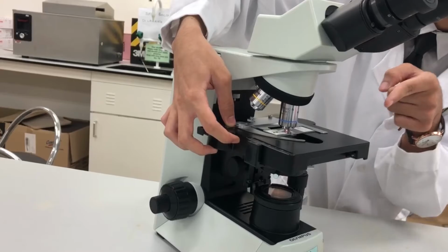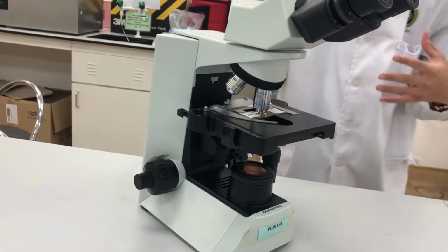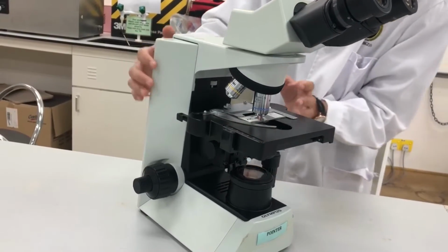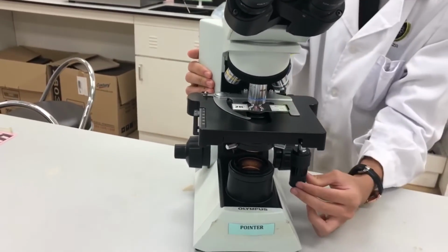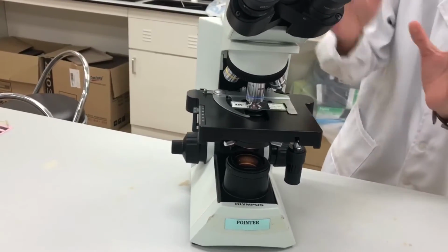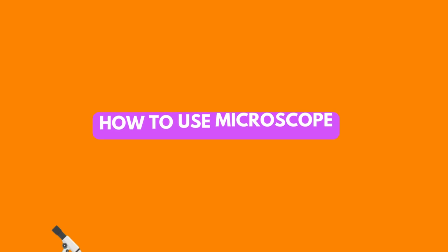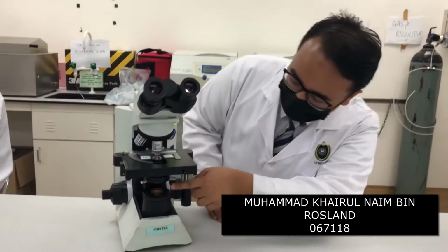The most common stage is a mechanical stage, which allows control of the slide by moving it using the mechanical knobs on the stage instead of moving it manually. So as you can see right here, we have the adjustment for the stage, which is called the mechanical knob. They are used to control the stage to your liking. Now, I'll proceed with the next component in the microscope, which is the diaphragm.